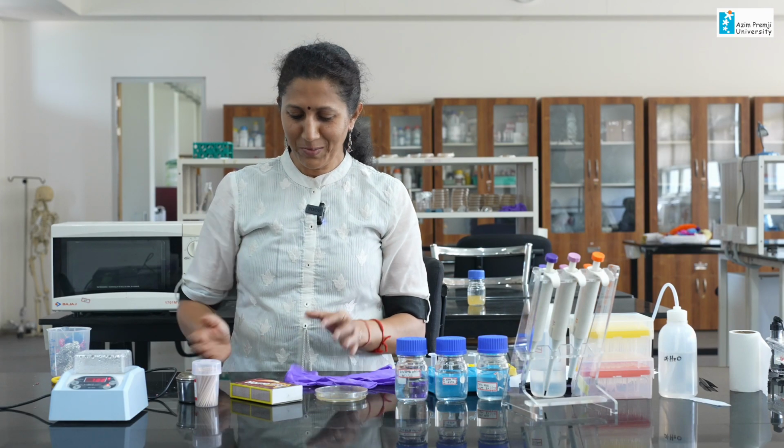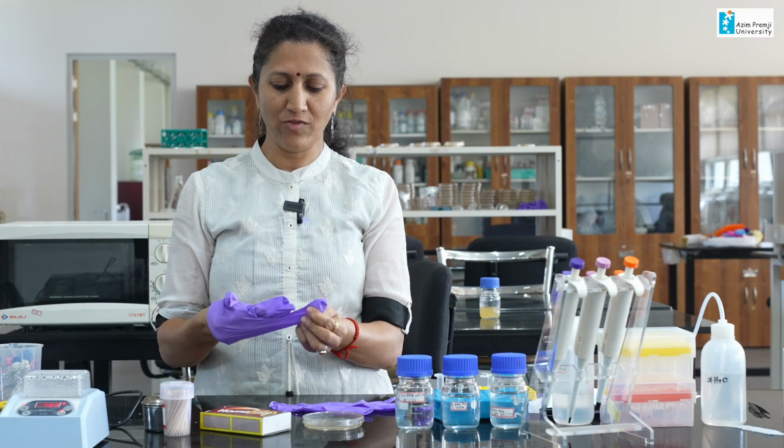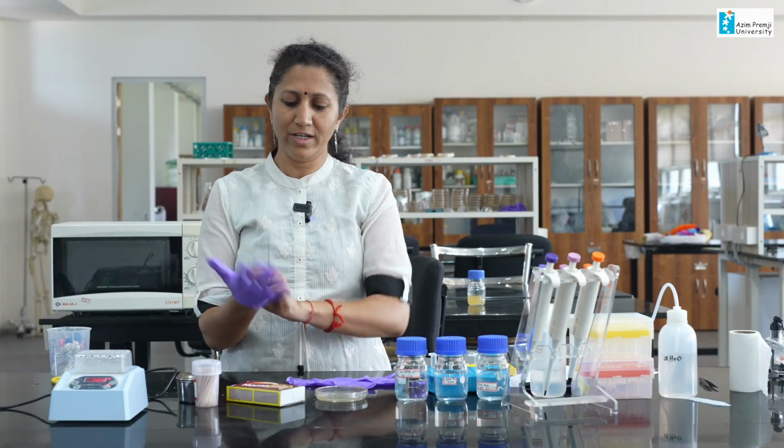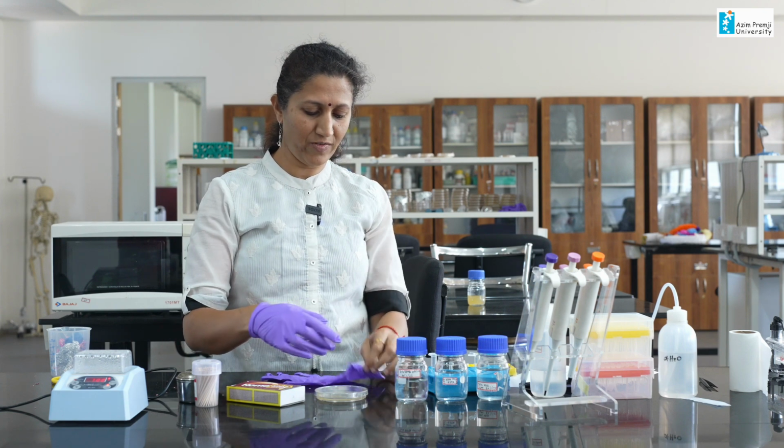The first important thing before starting any lab experiment is that you have to take care of yourself. You need to wear gloves because you do not want to contaminate your sample or damage your skin. It is mandatory to wear gloves because you will be using harmful chemicals, which may be carcinogens or other chemicals that can affect you.